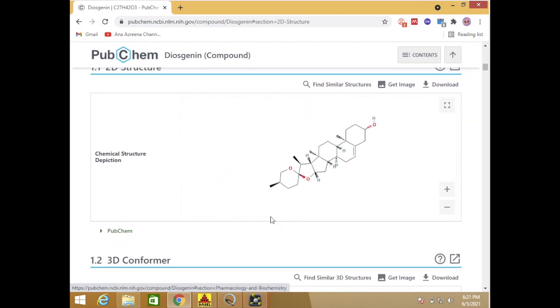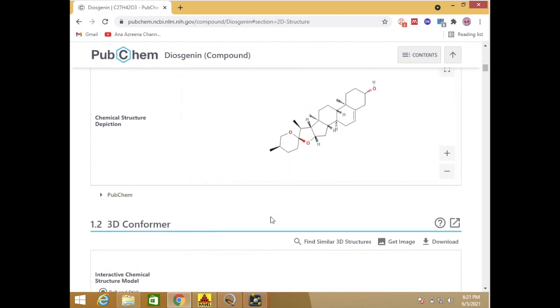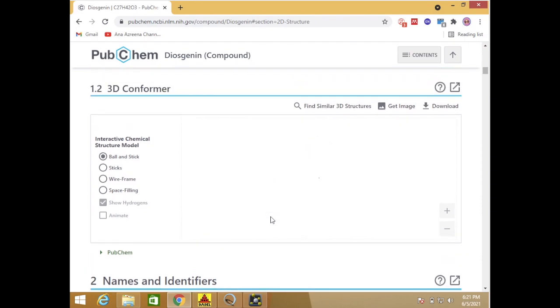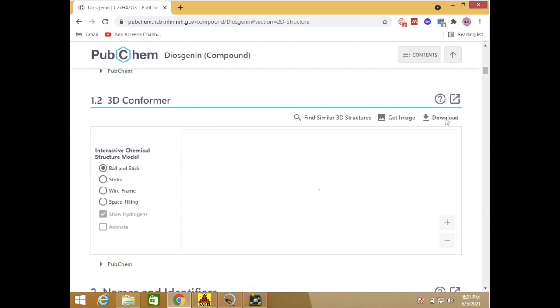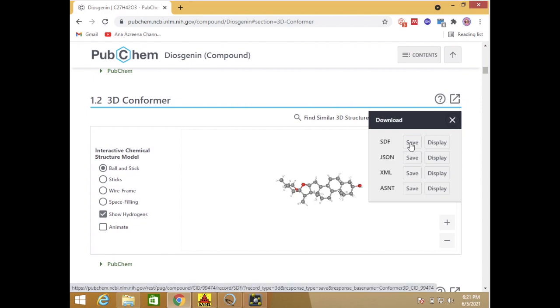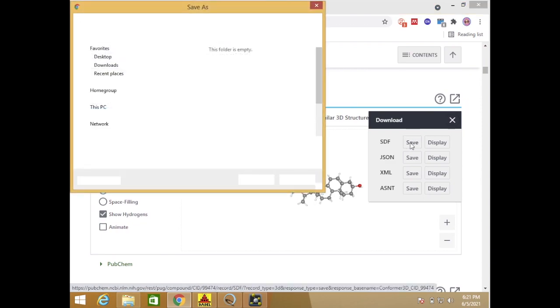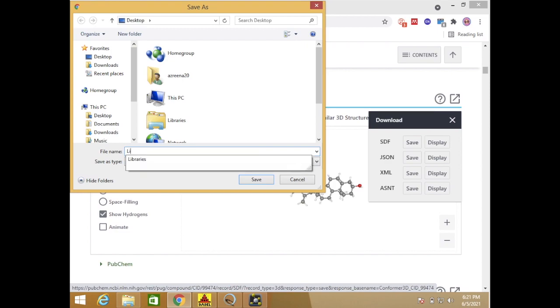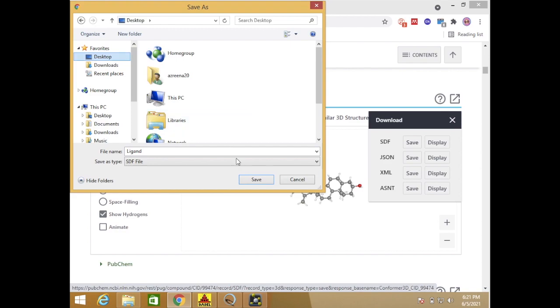This is the 2D structure and this is the 3D structure that we need. We just click the download here. So we download the SDF file. I will name it as my ligand here, so we just paste in the desktop.